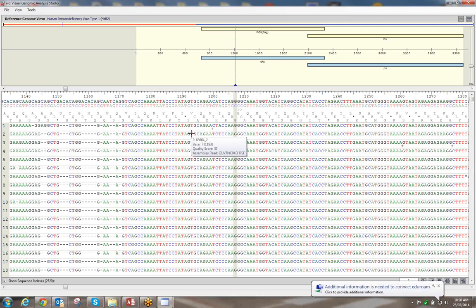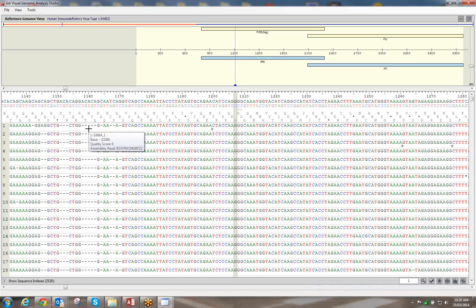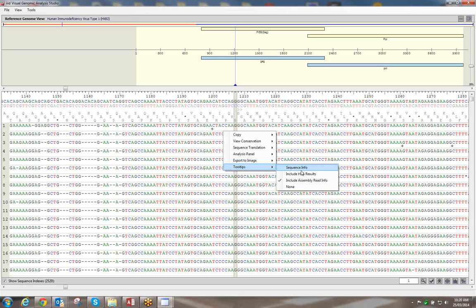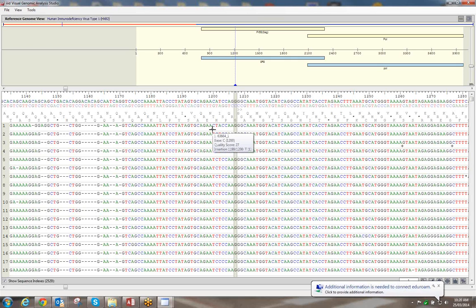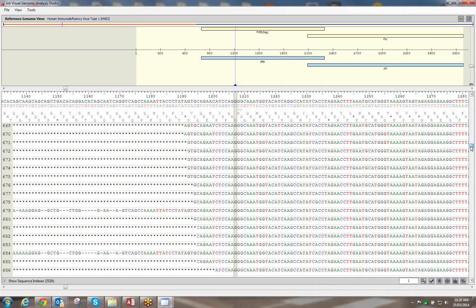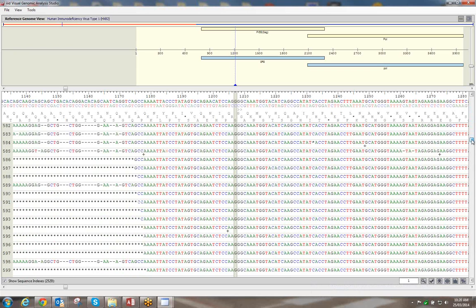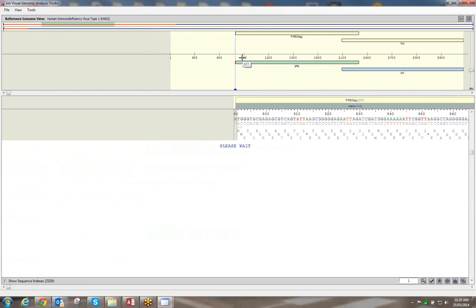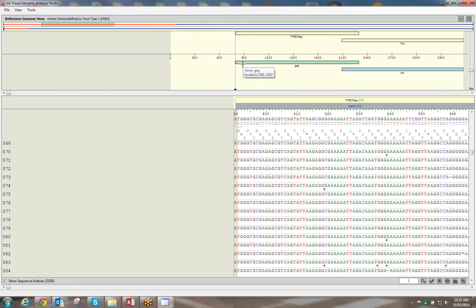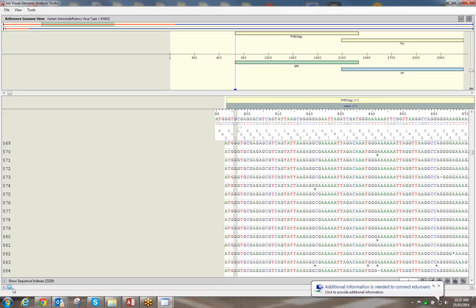The dashes represent deletions with respect to the reference, and the plus sign represents an insertion at that position. You can see an insertion T at that position, between the C and A. You can move up and down the sequences using the scroll bar on the right.